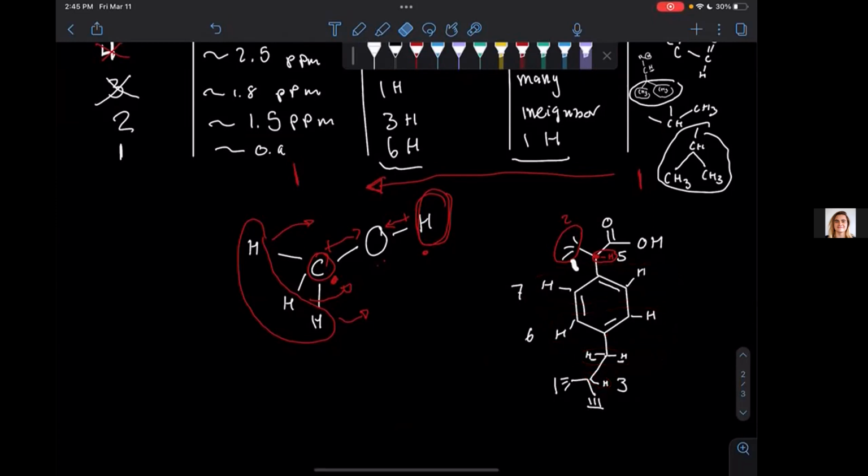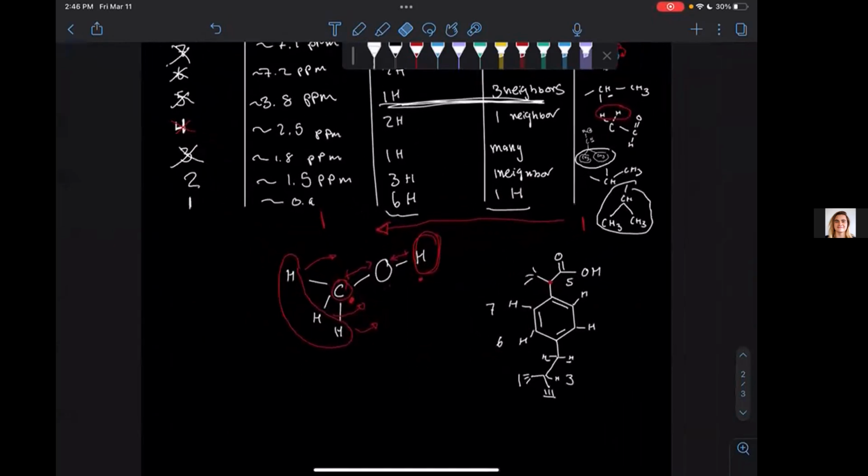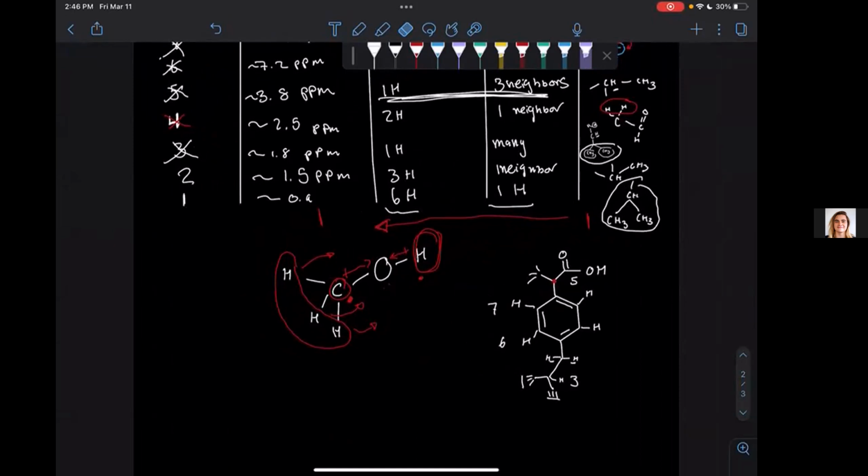And like I said earlier, this is going to be a little bit more difficult when you're on your own because right now we are only working with IR and/or just the proton NMR instead of IR and CNMR as well. So it's going to be a little bit harder to tell. Actually, I think it'll be easier with both, because we will have information on each carbon as well as each of the functional groups, which is helpful. But I hope I helped you learn something today.